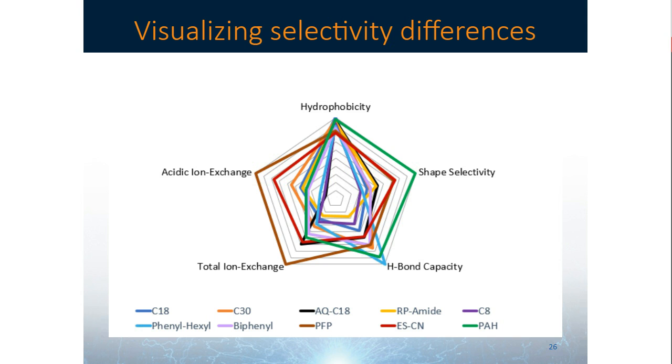So if you're going into a mass spec, I would recommend difluoroacetic acid, because that gives you a good compromise between the ionization efficiency that you get and nice symmetrical peak shape.